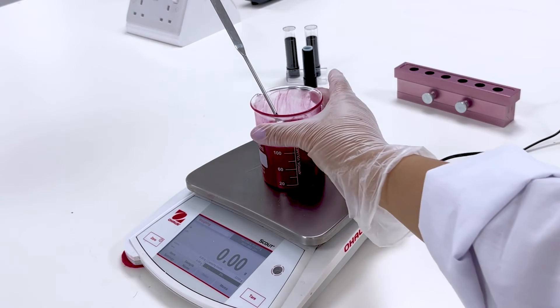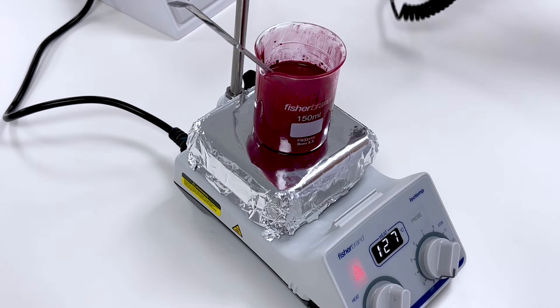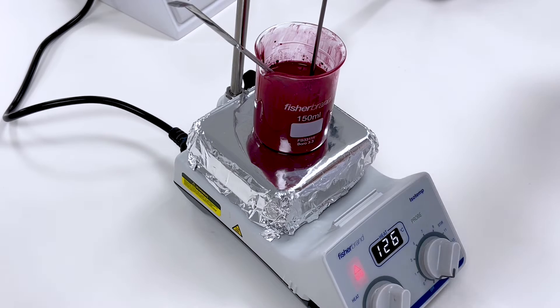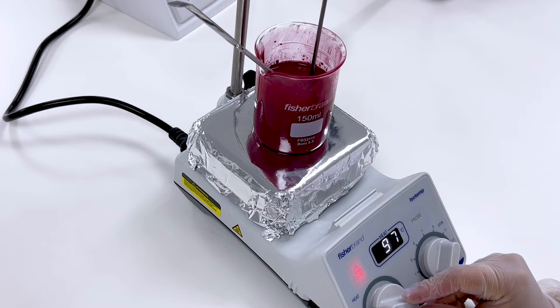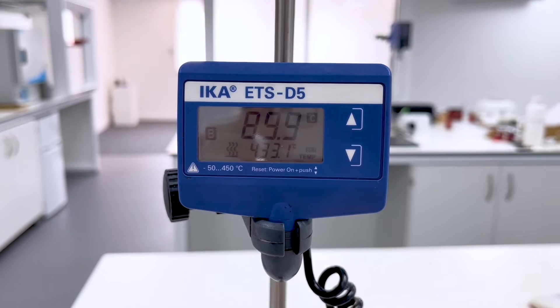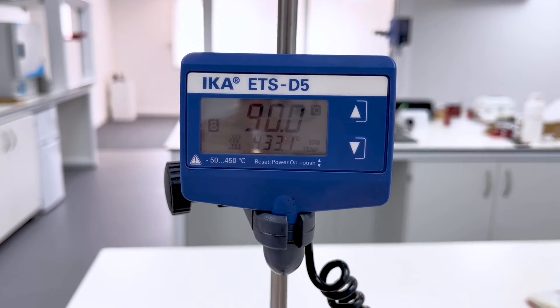Once all the ingredients are mixed well and incorporated, it's time to move the mixture to a hot plate. Here, we add a probe to keep an eye on the temperature. Next, heat the mixture until it reaches a temperature of 90 degrees Celsius. At this point, the mixture is homogenous and the waxes are completely melted.